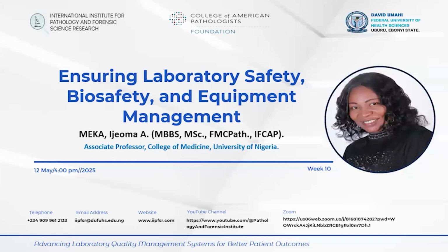So today we are going to be talking about ensuring laboratory safety, biosafety and equipment management. I welcome you to today's topic. We are gradually coming to the end of this series of webinar. I think we have 2 more weeks left and we'll wrap up.